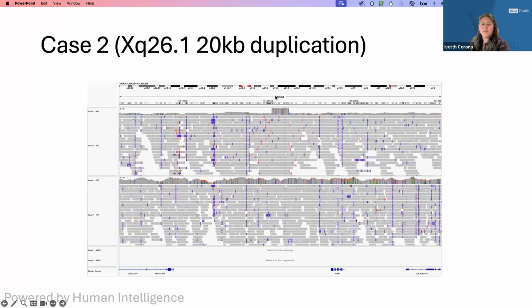And I'm not sure if this is actually annotated right now in ClinVar as pathogenic. So I would have missed it. I'm glad that we didn't ignore that. Yes, that's a very good point, the importance of collaboration between our clinicians and our bioinformaticians.